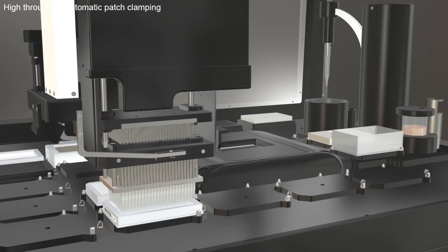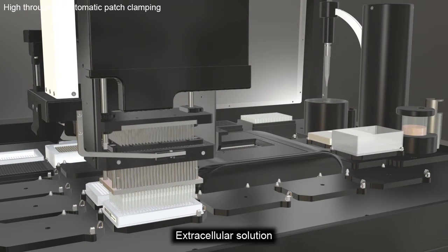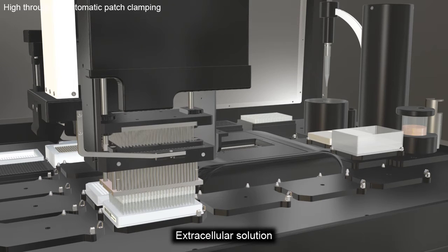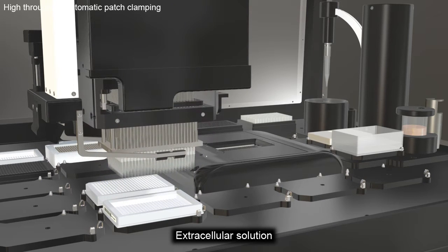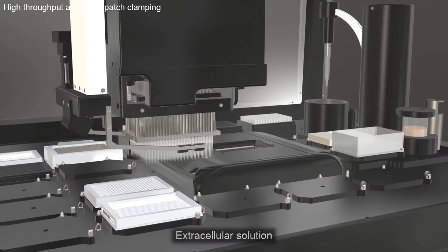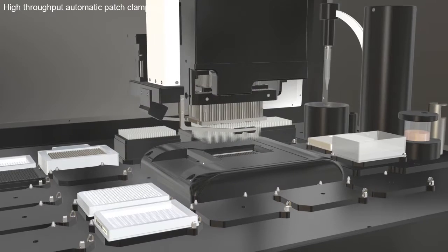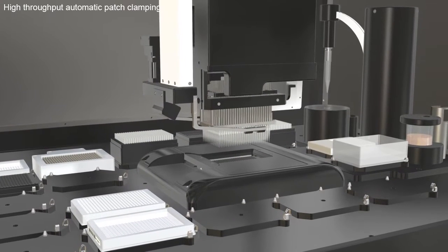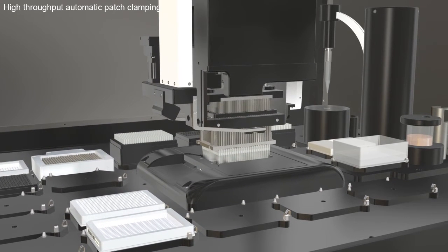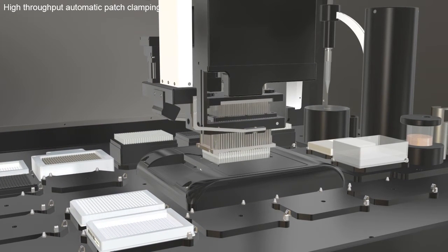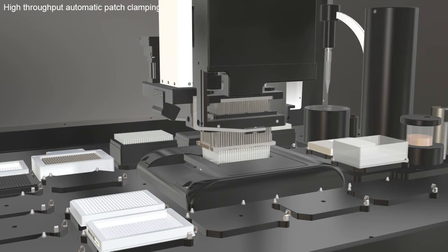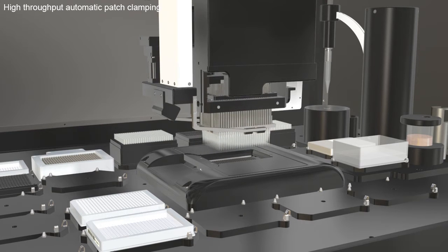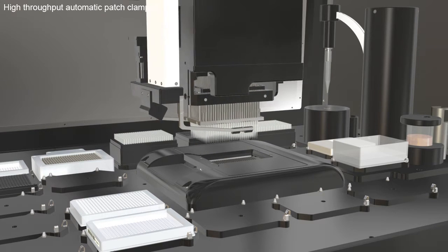The pipetter aspirates extracellular solution and dispenses it to the Q-Chip and then priming is done. The Q-Chip has 384 individual pairs of embedded silver chloride electrodes.